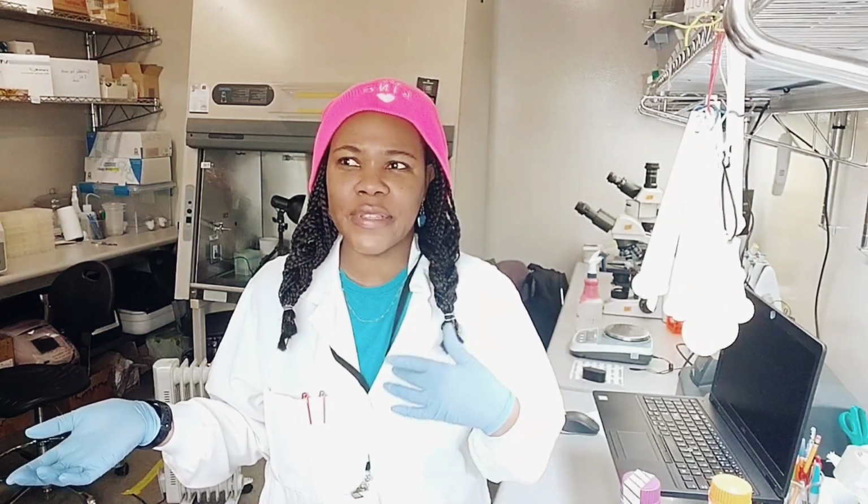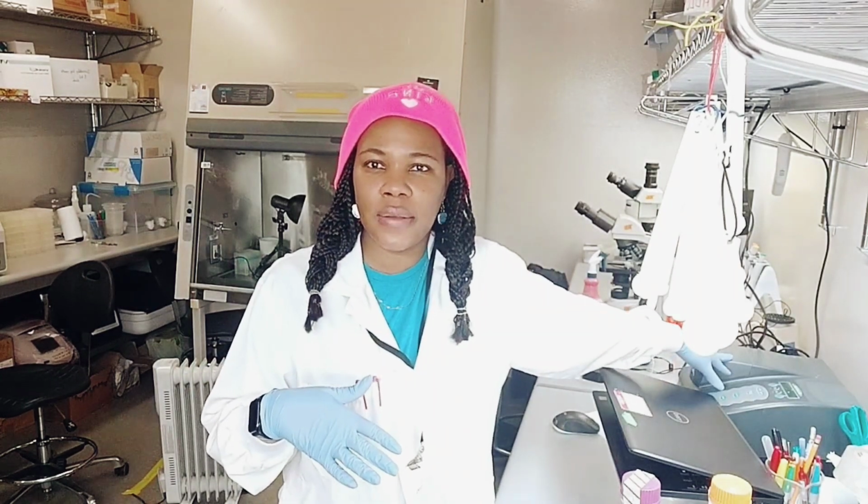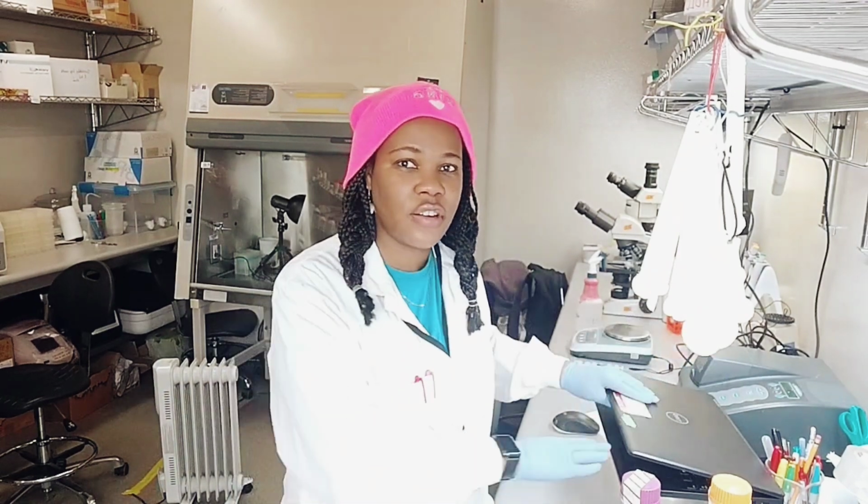And again, chitin is in the exoskeleton of crustaceans, crabs, shrimp, lobster, all those things people enjoy eating. And then once that's done and I do the microscope part of it, just for the QC, I will test using the spectrophotometer to see in terms of OD units, using the electromagnetic wave to get the concentration. So if you did chemistry or maybe microbiology, remember this from it.